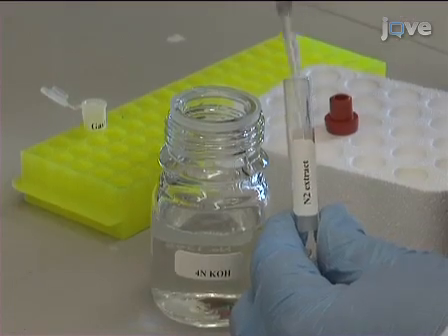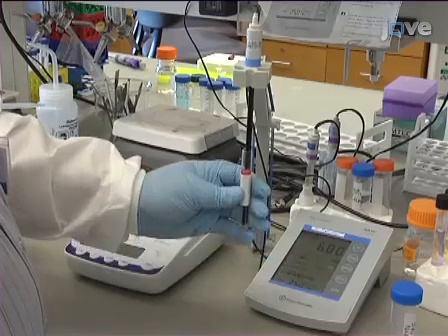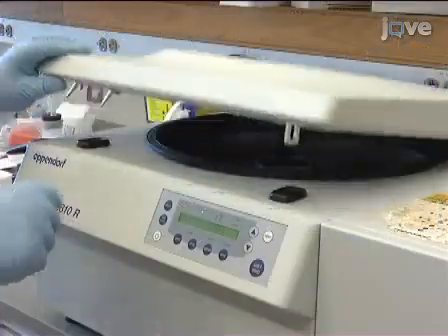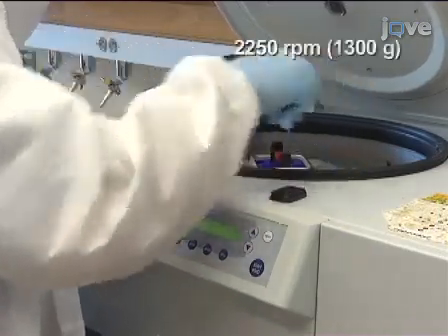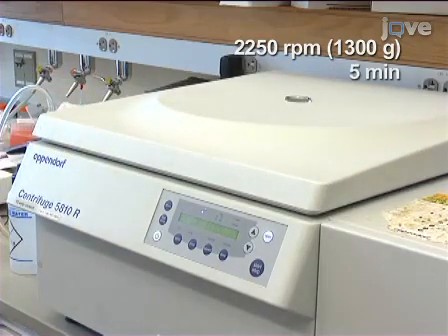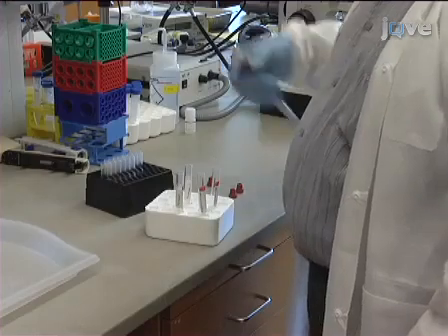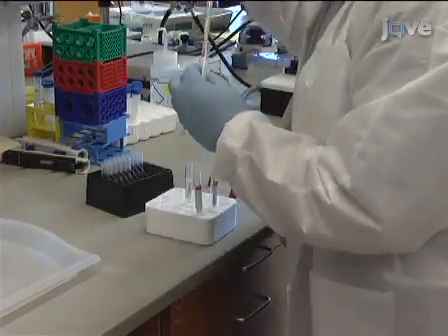Now add 4 normal potassium hydroxide to the supernatant until the pH range of the samples is 7 to 8. Centrifuge the neutralized samples in the 7 milliliter glass tubes at 2,250 rpm, 1300 Gs for 5 minutes to remove salts. Transfer the supernatant from each sample to a fresh 7 milliliter glass tube.